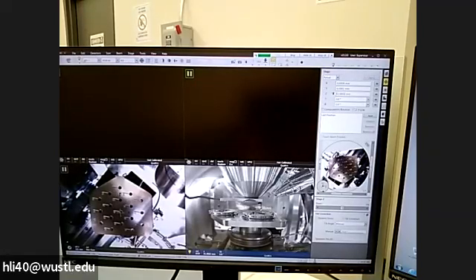No danger. Another way to drive is to click the middle wheel of your mouse, and you will see a yellow line. If you move the mouse up, it will drive the stage up. If the arrow is far away from the yellow line, it will go very fast. If you want to slow down, you just move close to the yellow line. If you move the mouse down, the stage will move down. Okay, that's how we drive the stage.